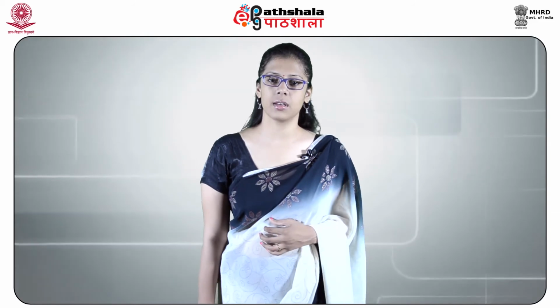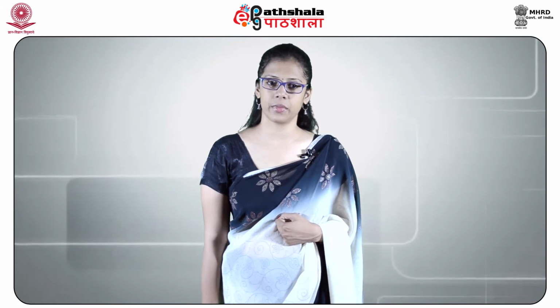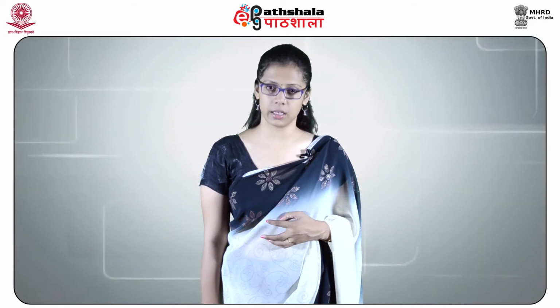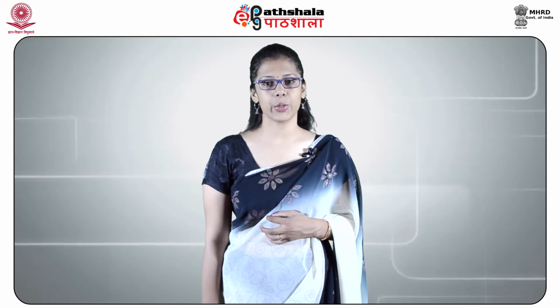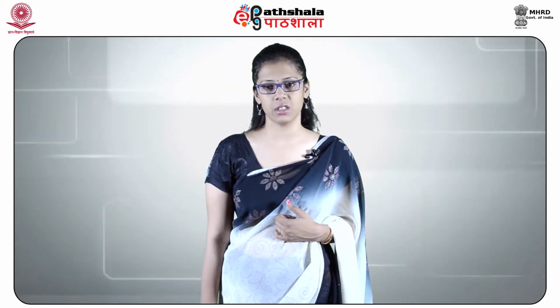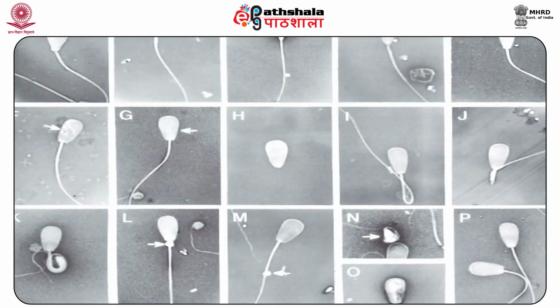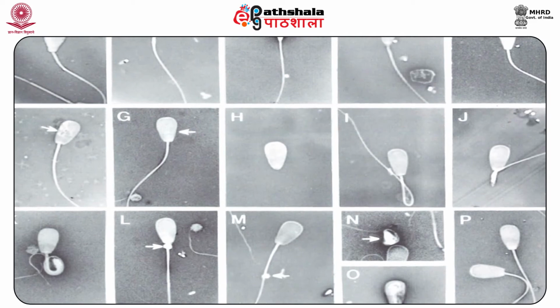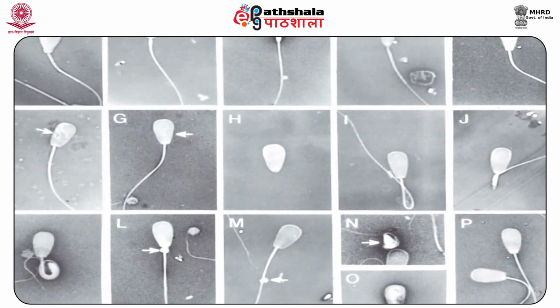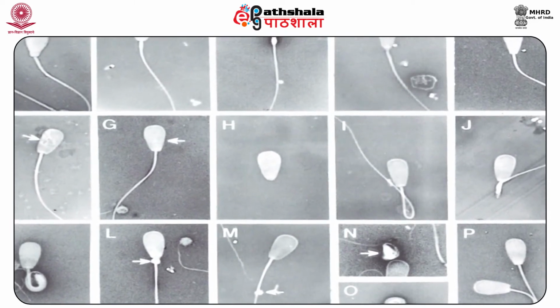Now next is the Florence test. This test was discovered by Dr. Florence in the year 1896 when Florence reagent, that is potassium iodide, iodine plus water, is applied to the slide. It produces rhombical shaped dark crystals of choline periodide. Similarly, any tissue or biological material containing sufficiently high choline concentration would give a positive Florence test.